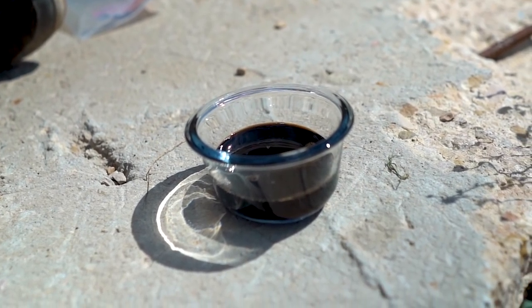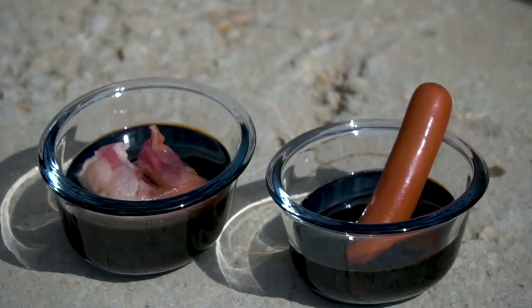In today's video we're taking a look at sulfuric acid to see what it does when it reacts with sugar and to see how long it takes meat to dissolve.